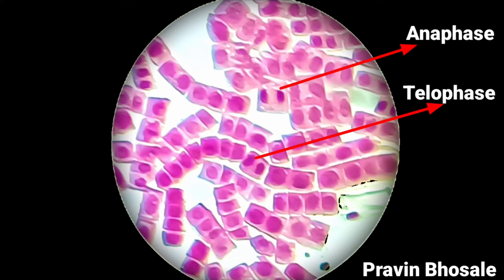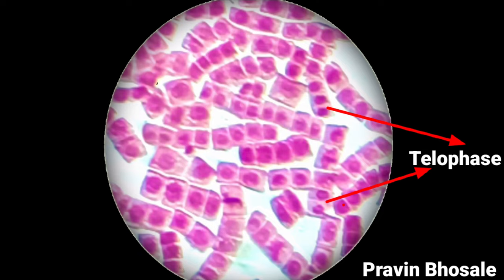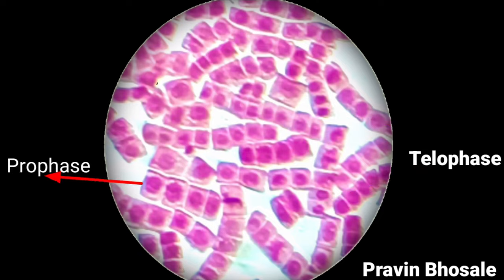Here you will see telophase — there are two nuclei in the cell. Again you can see a telophase: two nuclei are there in the cell. This is prophase. This is telophase.